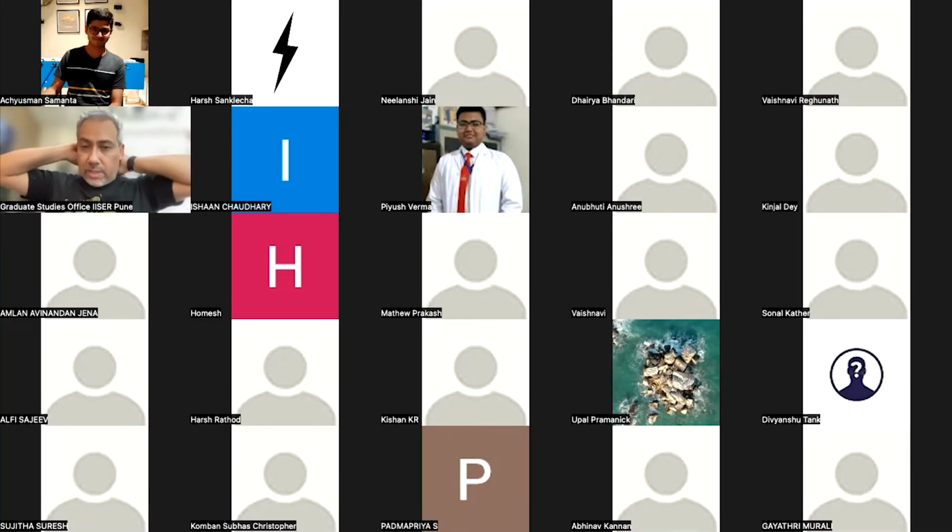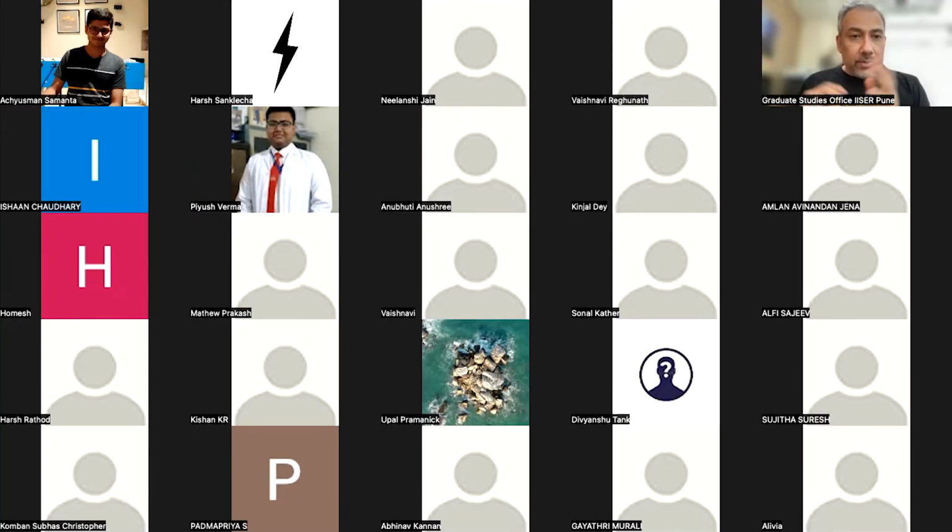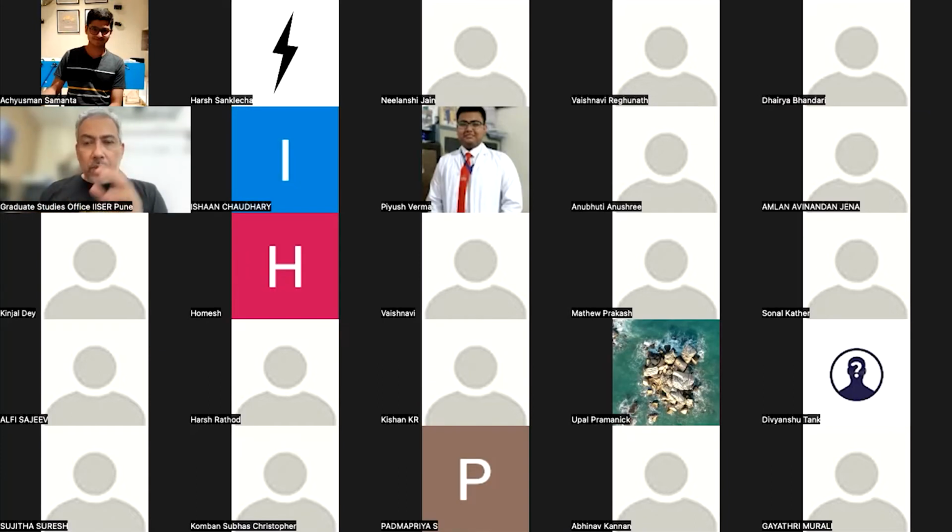Good question. Right. So you can do both. You can use fluorescence microscopy to largely pinpoint a particular thing inside the cell. It could be, for example, there is a dye called DAPI that goes and labels the entire nucleus, because it actually binds nucleic acid, and it will fluoresce very brightly in the nucleus. And this can be used to visualize the nucleus.